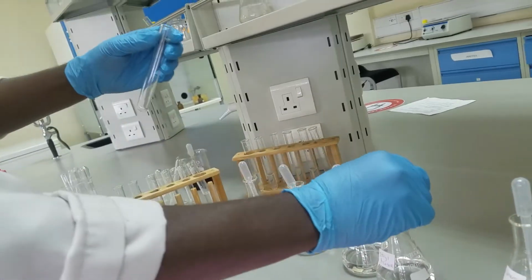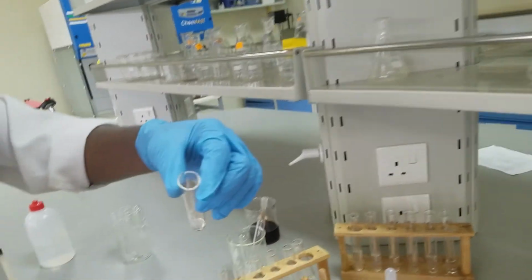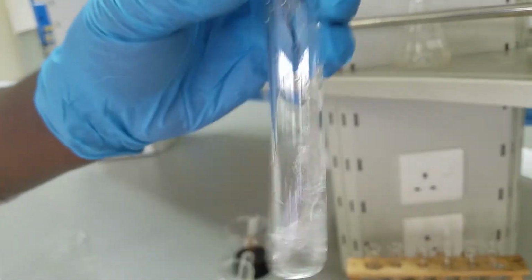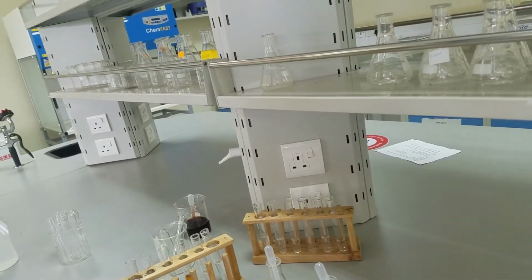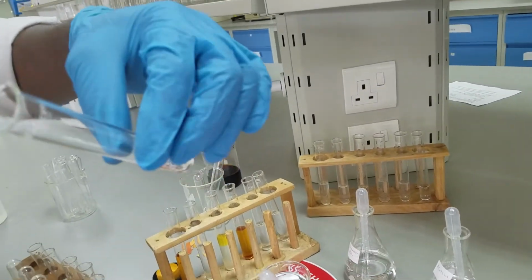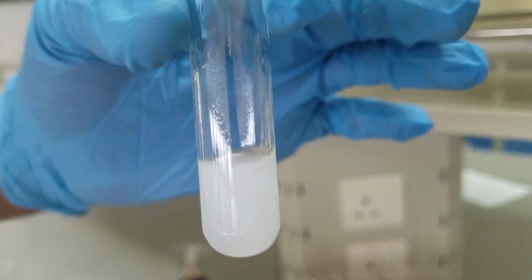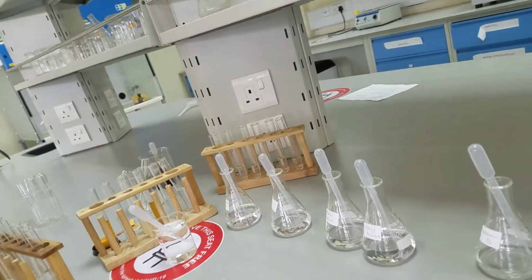Then we go to our ethyl acetate. Add. See if there is any observable changes. So I'll go to our last part, our unknown B. Add. That is your unknown B with sodium bicarbonate. And finally, unknown C.